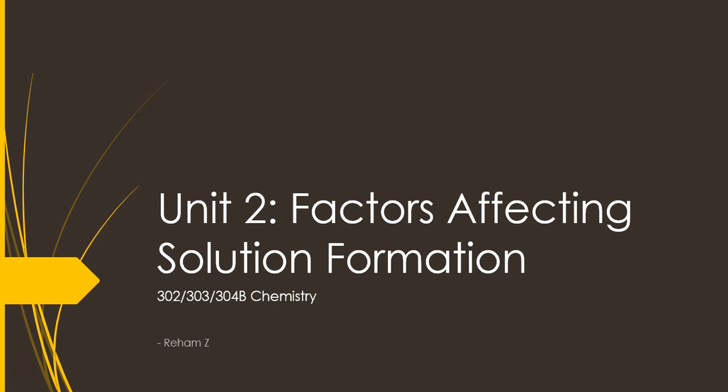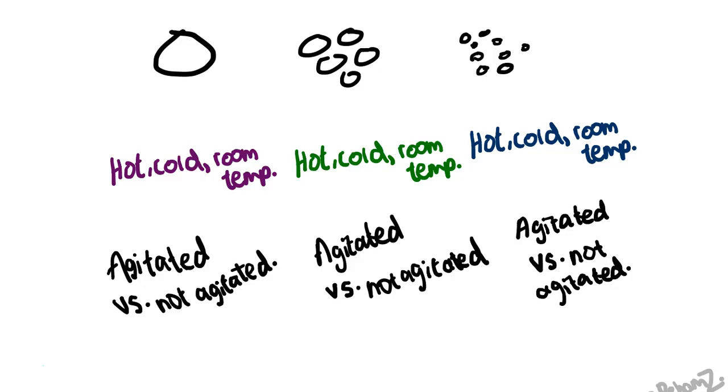Some of the main things that it is trying to say, let me just bring up my pen, is what it's all about. So I wanted to make an illustration for you, which I did over here, which tells you exactly what is going to happen. So basically, we're taking 3 vials, which are like tubes, and basically 6 tubes, and we're going to be doing 2 different sort of experiments on them.